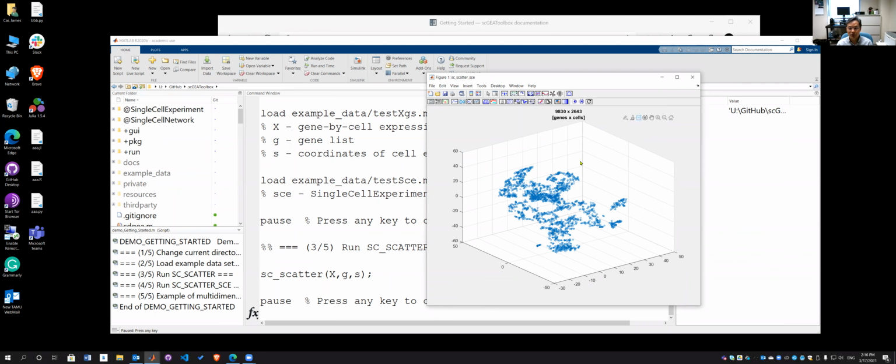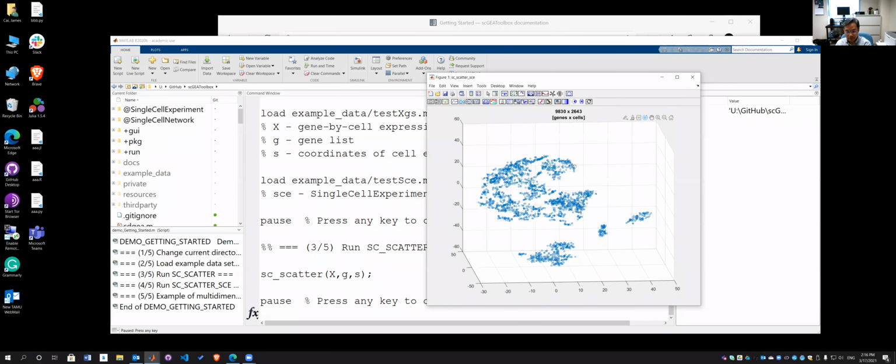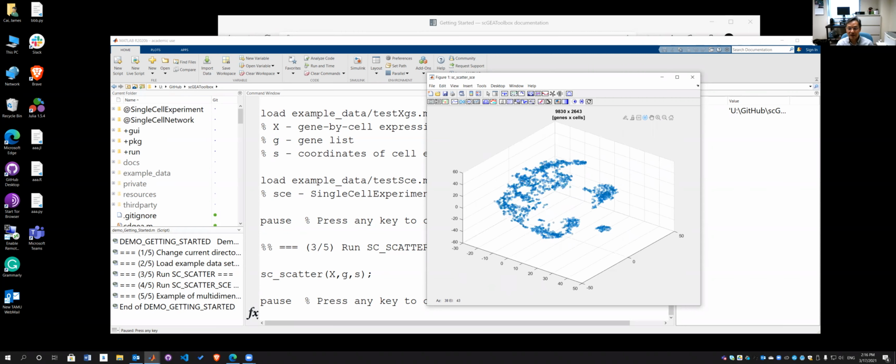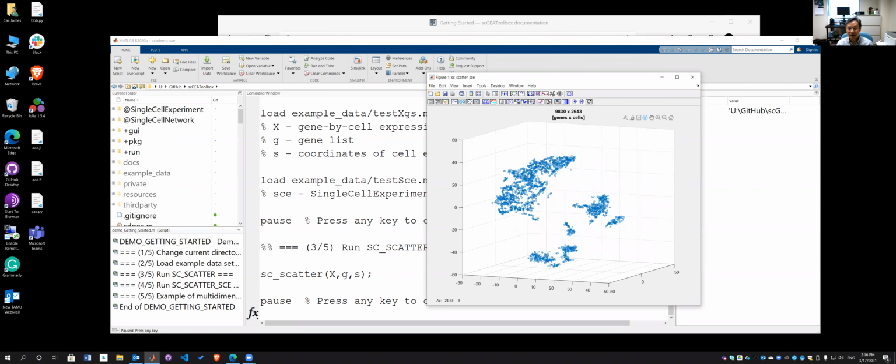So you know you can do this. I think that's exactly the data you have already seen last week.